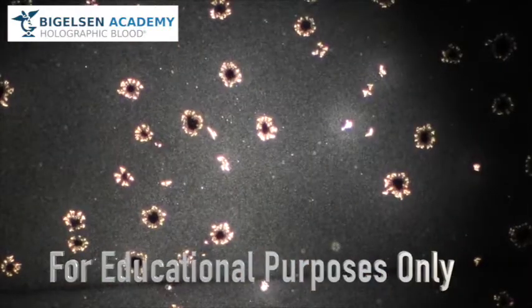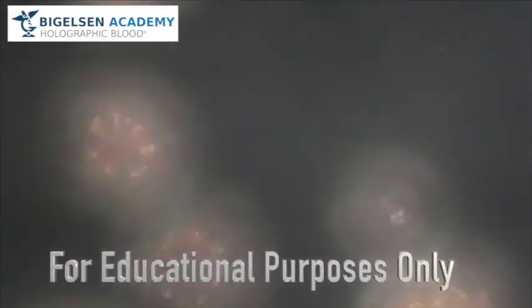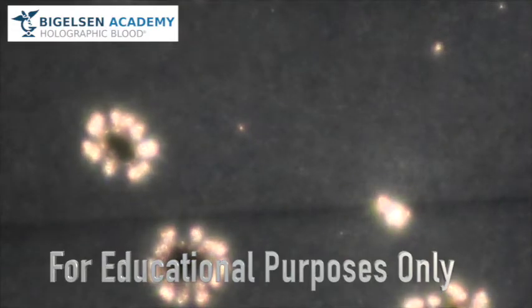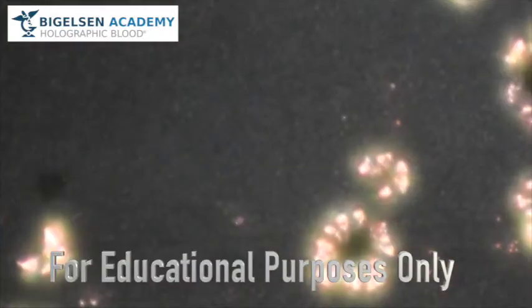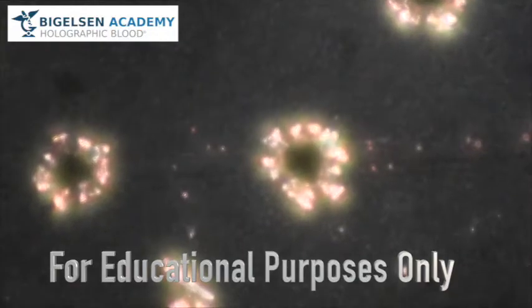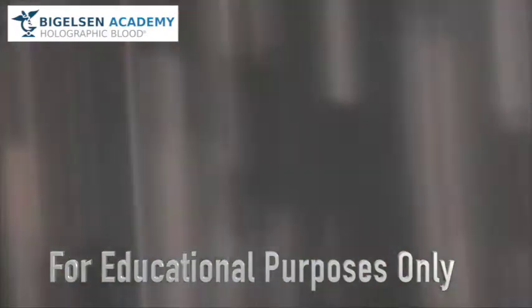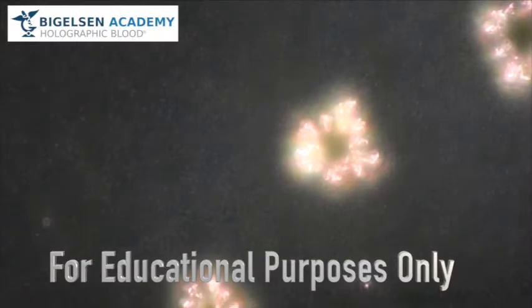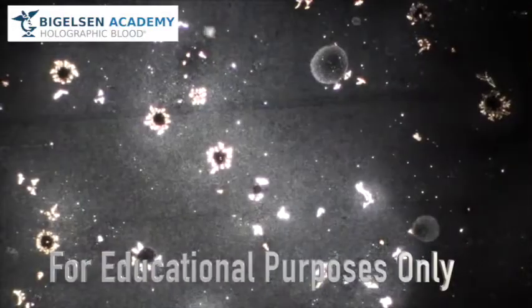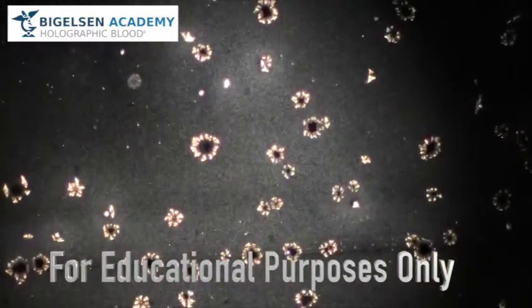What the hell is all that? Let's zoom in a little bit. So this is just crap on the slide. That's a lot of crap. Think about looking at the blood and looking at teeny microscopic things with all this crap in the way. Look at all this crap. Can we find a spot without crap? Nope, not gonna happen. Think about all that crap, then think about putting a cover slip on top of it. What the hell is all that?